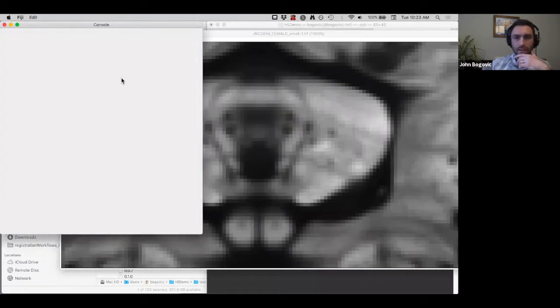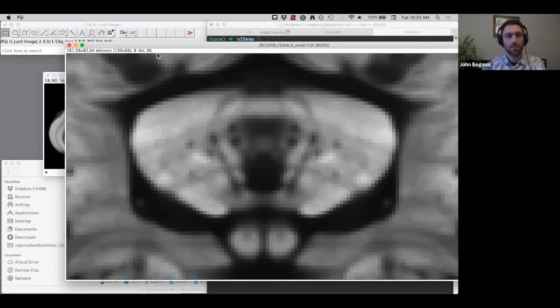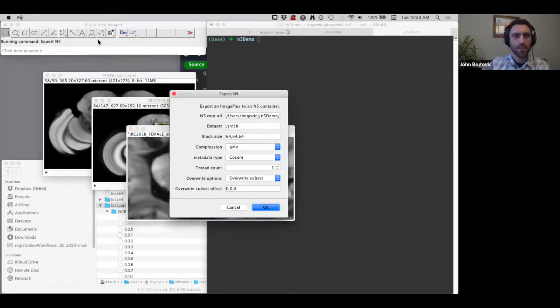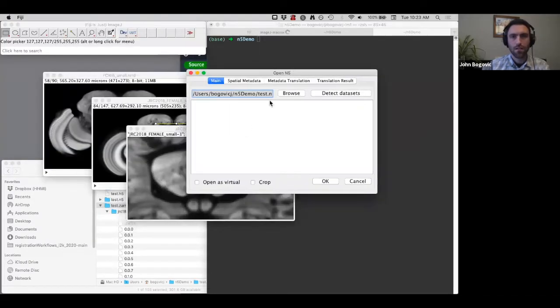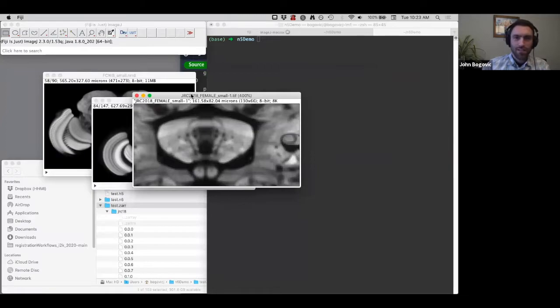And I'll hit OK. And of course, I'm going to try something different. Let's try this. Okay, I don't know what I'm doing. Let's see what happened. Let's see if it actually did anything new. Okay, I messed up something. John's going to try this again later.